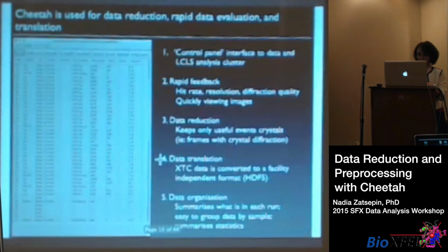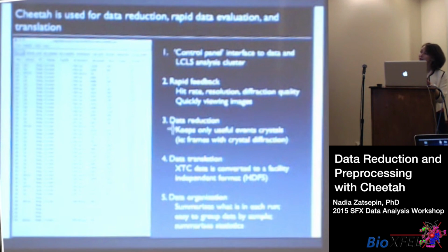So the Cheetah GUI, it's not very fancy, but it's very, very functional. It's running with IDL. You do not need an IDL license to run it, and like I said, it's installed at LCLS. The GUI looks like this, that allows you to launch hit finding on any run that has been collected. Now I will say, what is a run?